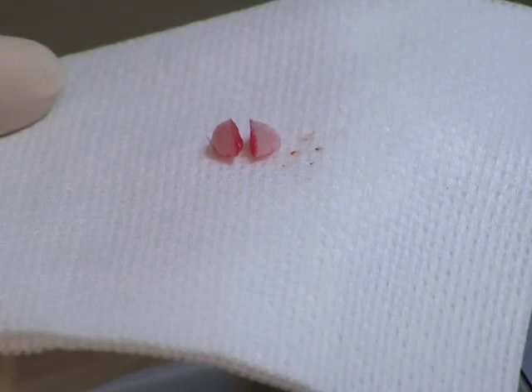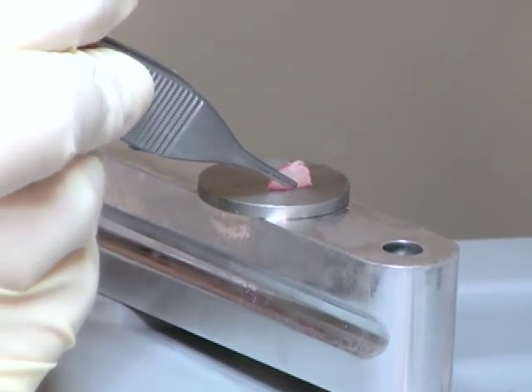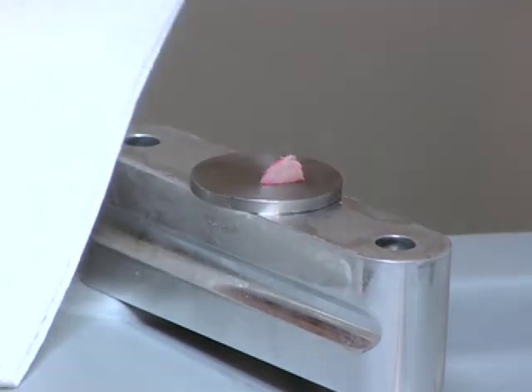When vertical biopsies are needed, the moist tissue will stick to the cold disc and stay in place during the embedding process, providing a true cross-section of the specimen.